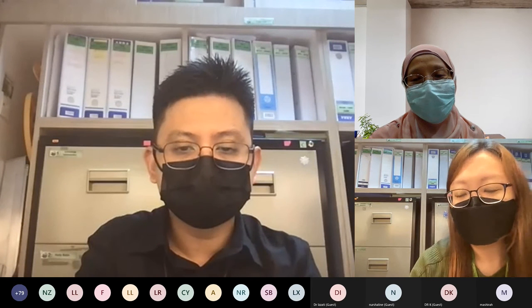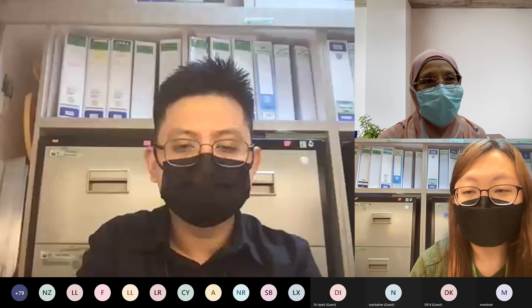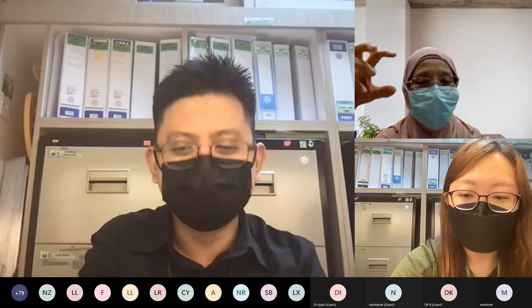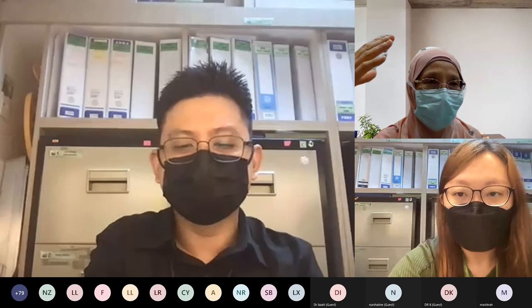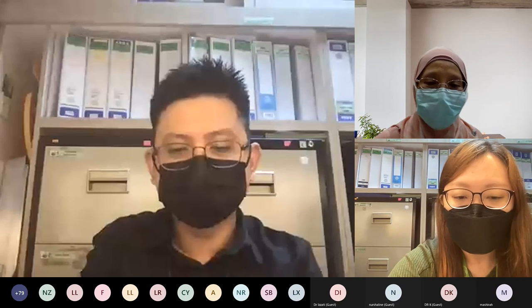I think that standard is everywhere. So well, the 3-layer is a little bit different in that one because you don't need all the absorbable plastics, the plastics that you buy, and you're not sending it by post, by air, or by another transport, but you are the one who is sending it by land transport.